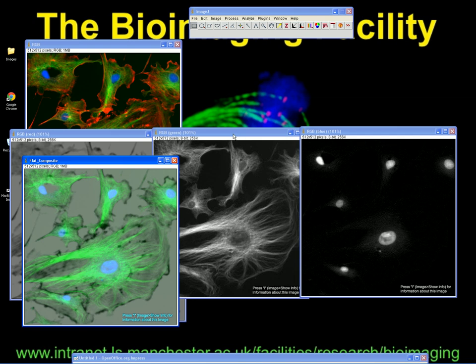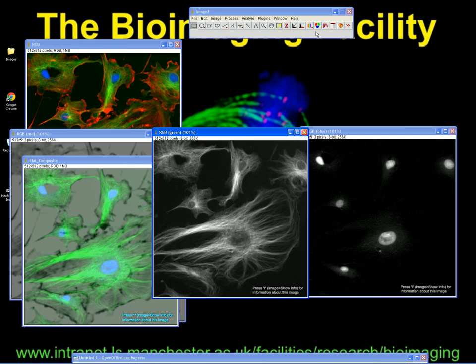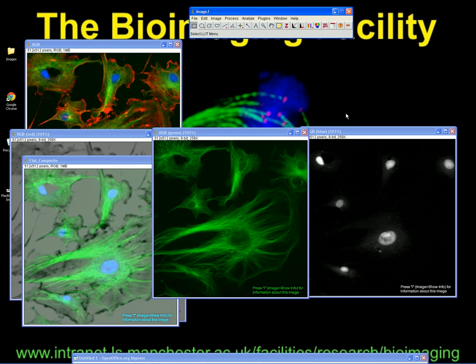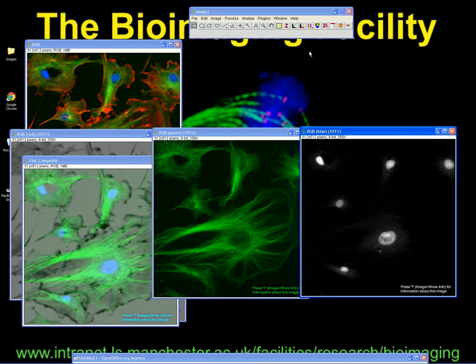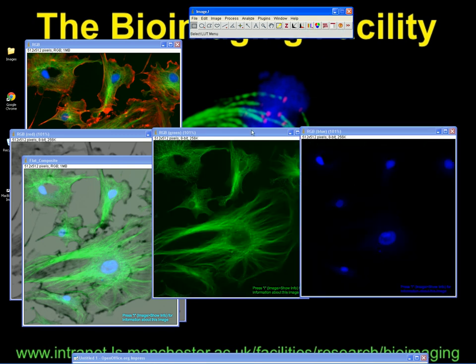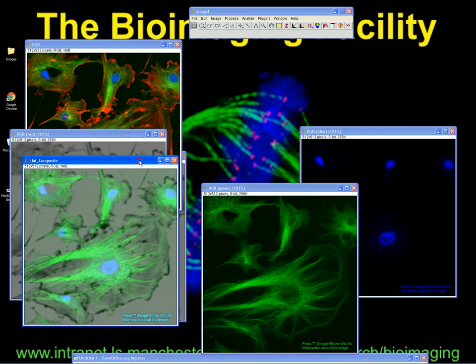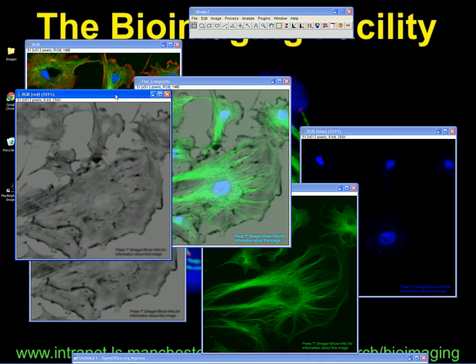You've then got the option of whether you want to keep the fluorescence as grayscale images or pseudo-colour them as well. It makes no difference to how they work. What we can do is make this one look green and let this one look blue. These are the four images that we want to work with.